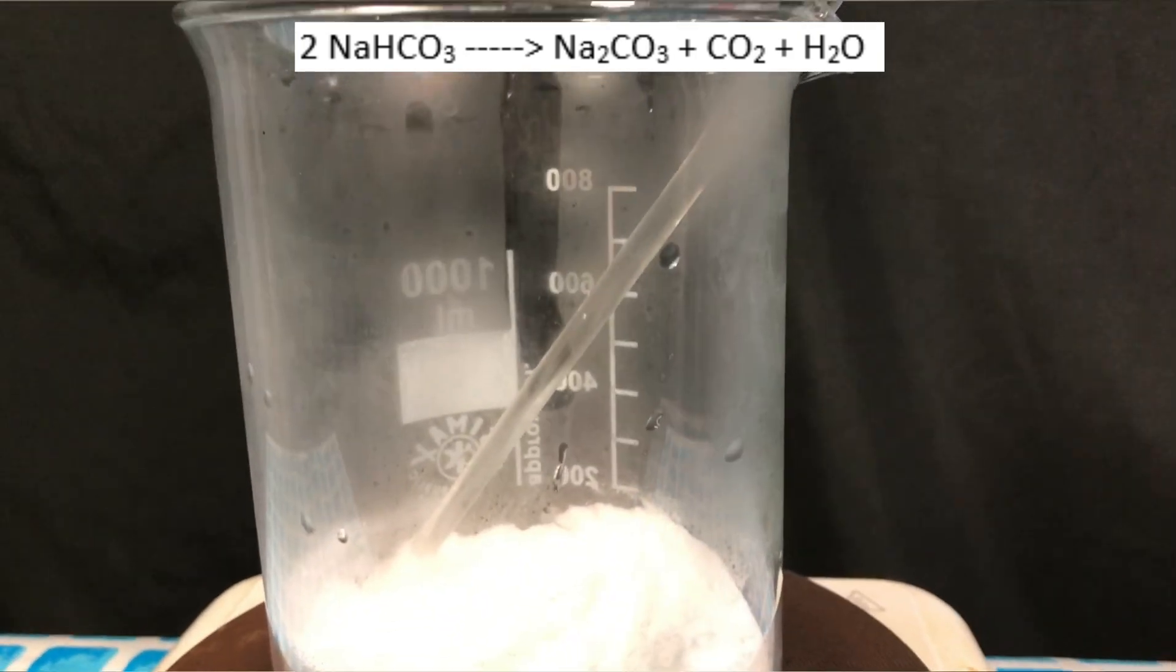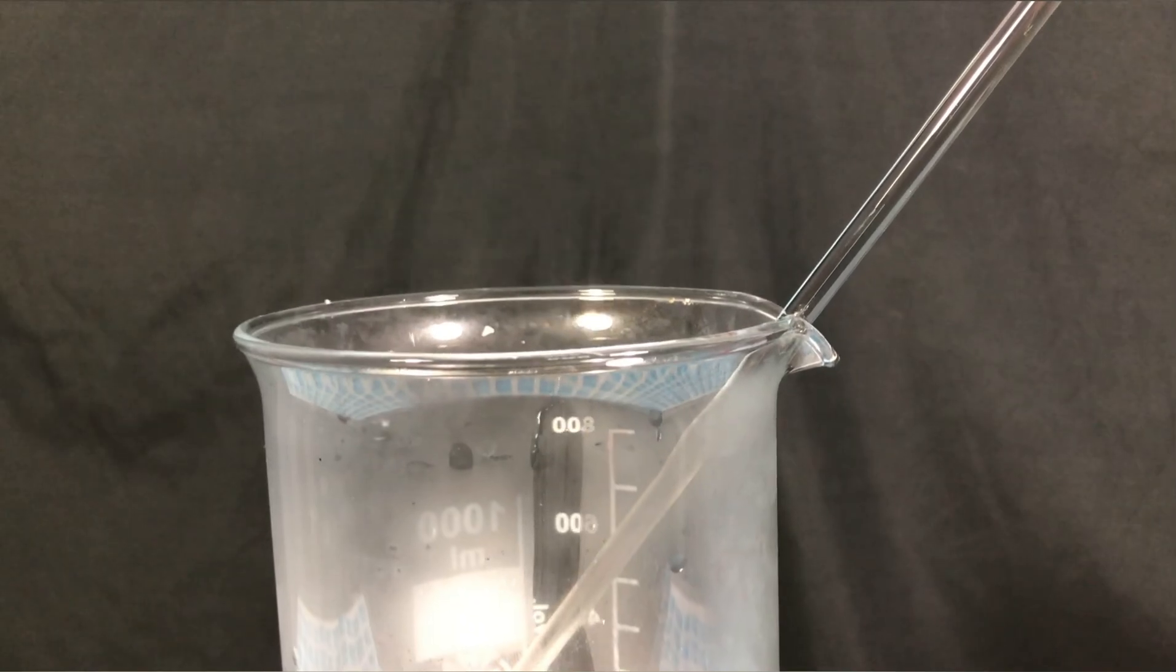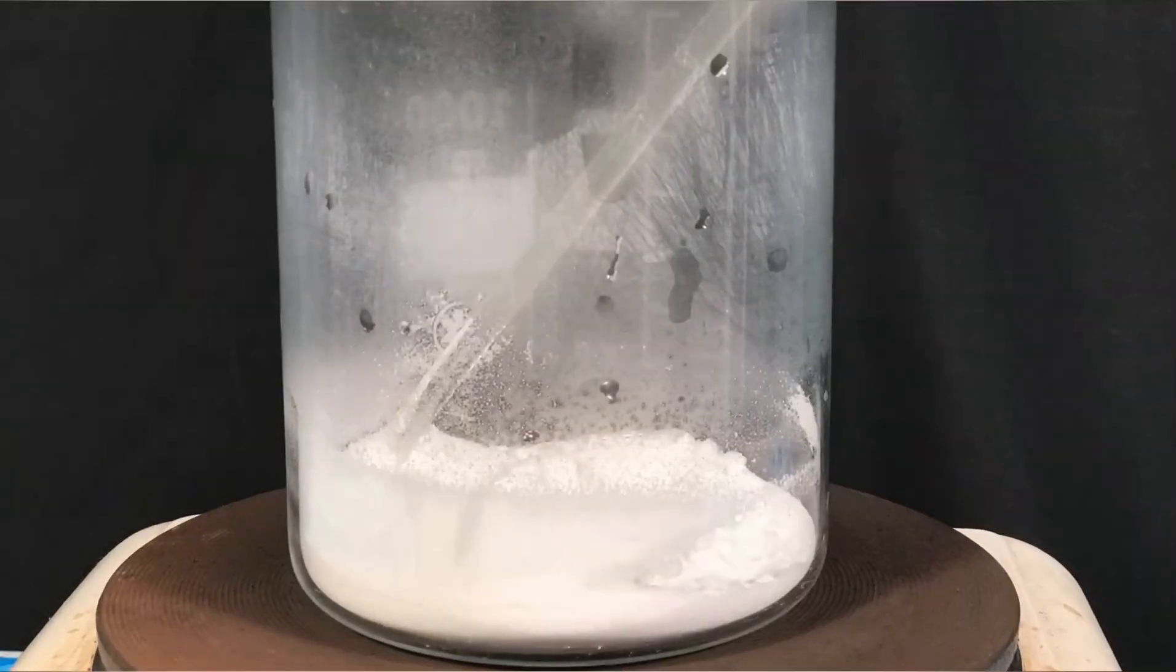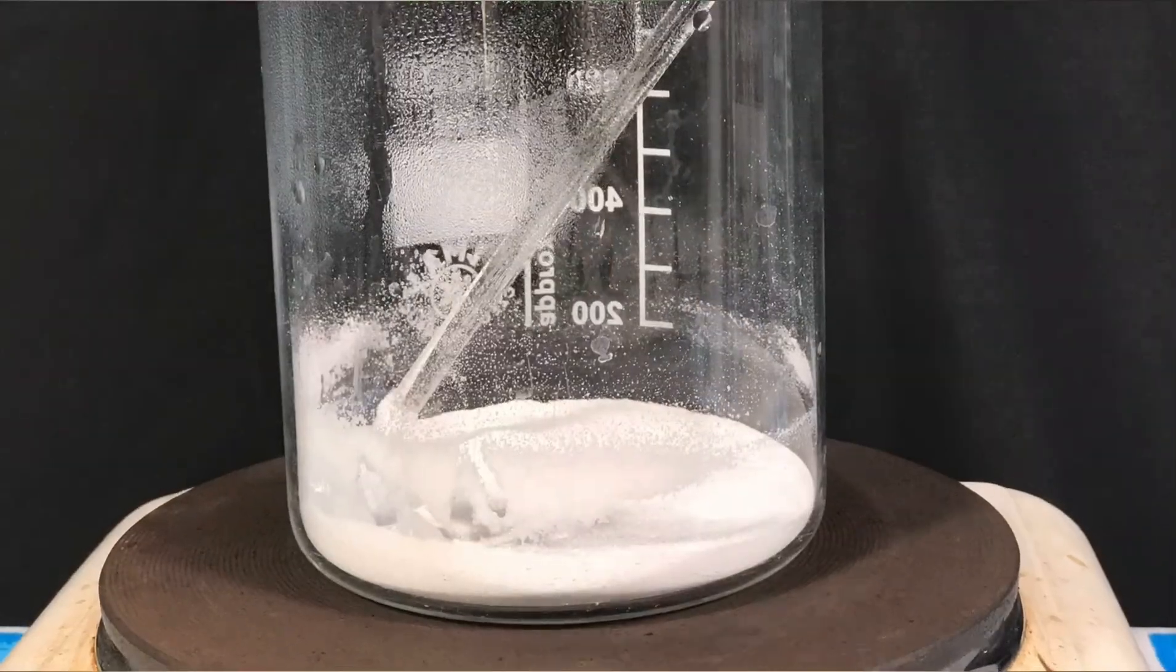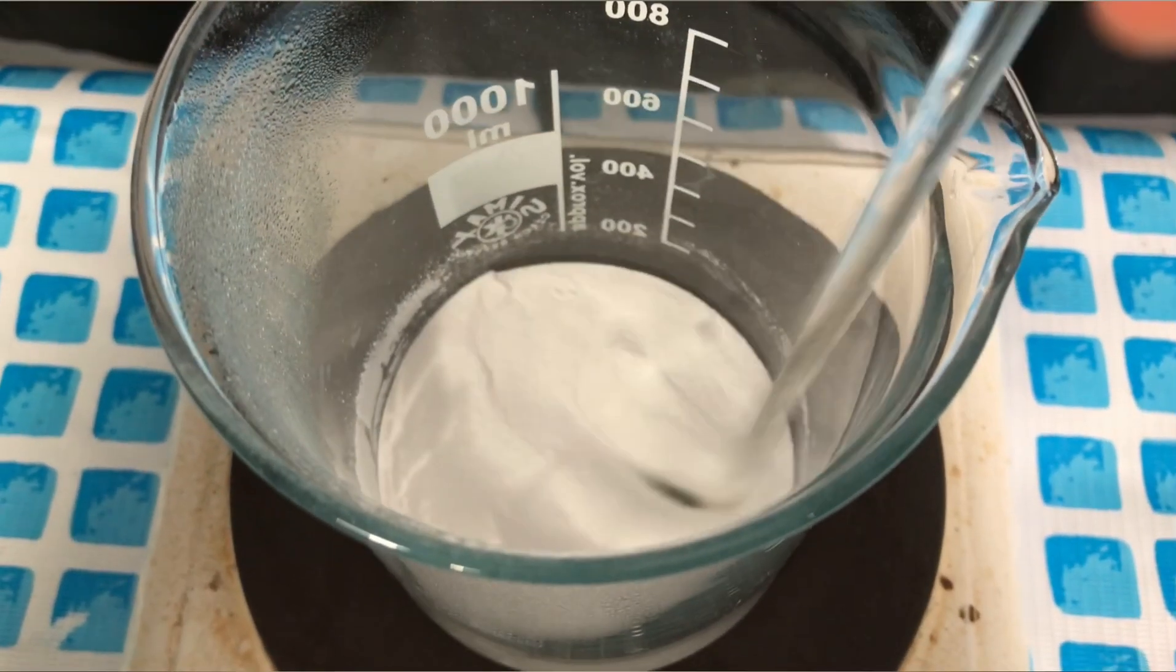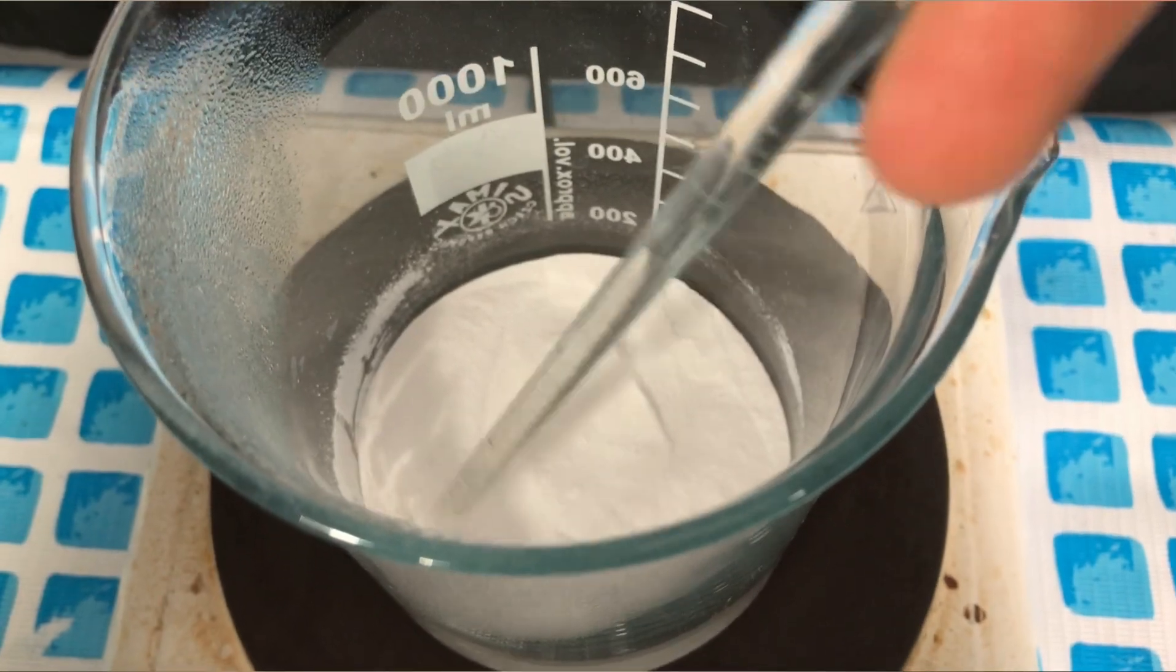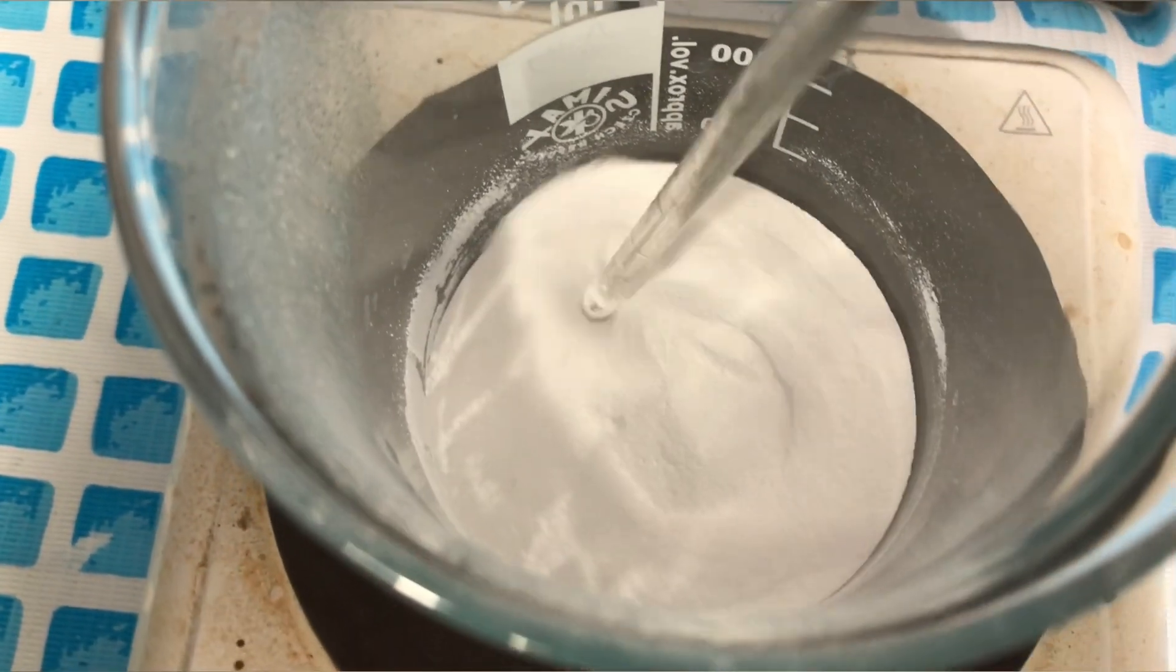Some water vapors start to condense at the cold walls of the beaker. The sodium bicarbonate was occasionally stirred to make sure that even unreacted sodium bicarbonate gets to the hotter bottom of the beaker, reacting and turning into carbon dioxide, sodium carbonate and water.